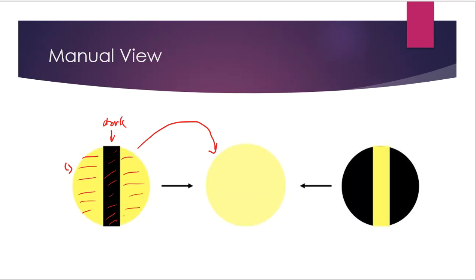There were some instruments also that would peg dark sides with a light side in the middle. Again, the same thing happens here. Sometimes this would be due to an overturning of the dial, or sometimes it would just be the way the instrument's manufactured. It just really depended, but still the same concept is in place. You look through the eyepiece and you begin to turn, and you turn until you get to something that looks very universal from top to bottom, left to right, and the light intensity is the same no matter where you look. So that is a little bit about the manual methods that happen in a polarimeter.